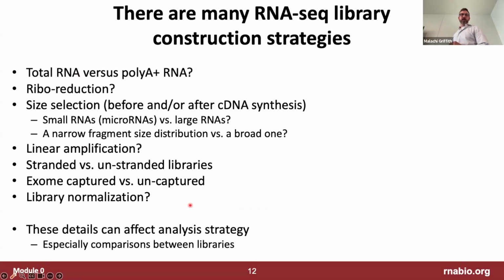Okay, so unlike some of the DNA sequencing approaches, RNA-seq remains a little bit more of a Wild West in terms of the way the data gets generated in the lab. And I think this has become a little bit obscured because a lot of people now don't make the library themselves. They just send their RNA sample to a core and they do what they do. But often a lot of these core facilities will have multiple RNA data generation approaches or kits that they use, and they'll have like a menu of choices you can pick from.